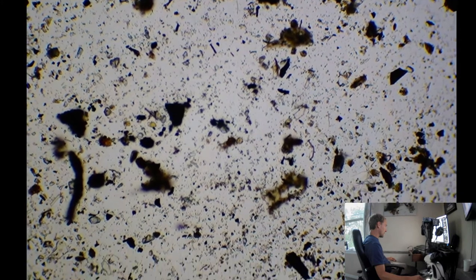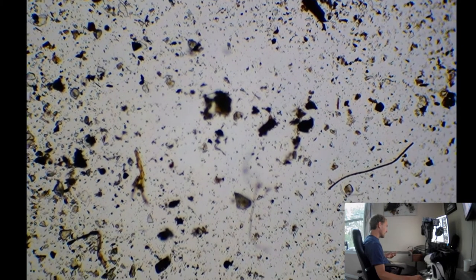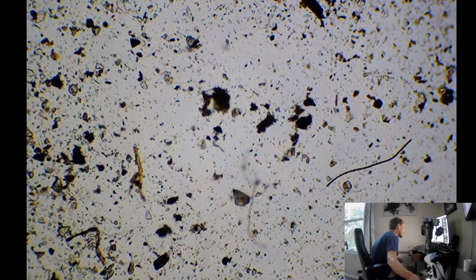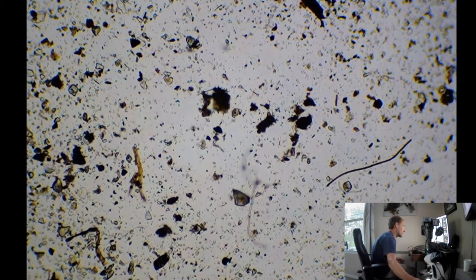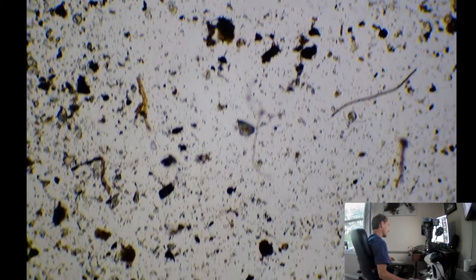What else might we find? Found amoeba. We found a cyst, I believe. And here's a... Yeah, there's an example of a... It's got some nice separations here, the septi. And this looks like another. It's probably a nice beneficial bacteria. Almost looks like it could be another small nematode right there taking a nap. Well, let's move on and see what else we can find.